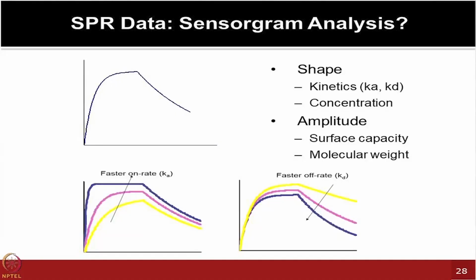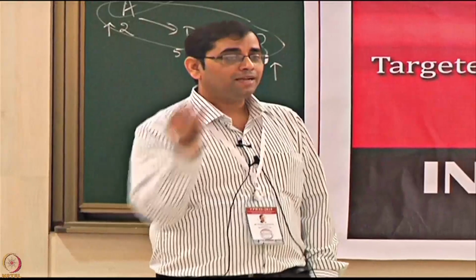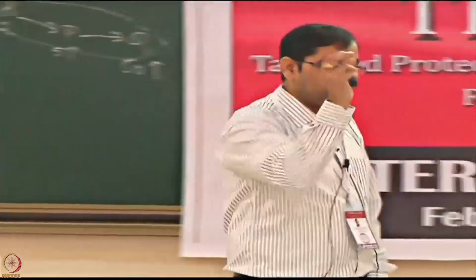You want just a very quick response. So your on rate, the time you are looking at, versus your off rate becomes very different, right? So you want immediate action to happen. Something has to bind very quickly.